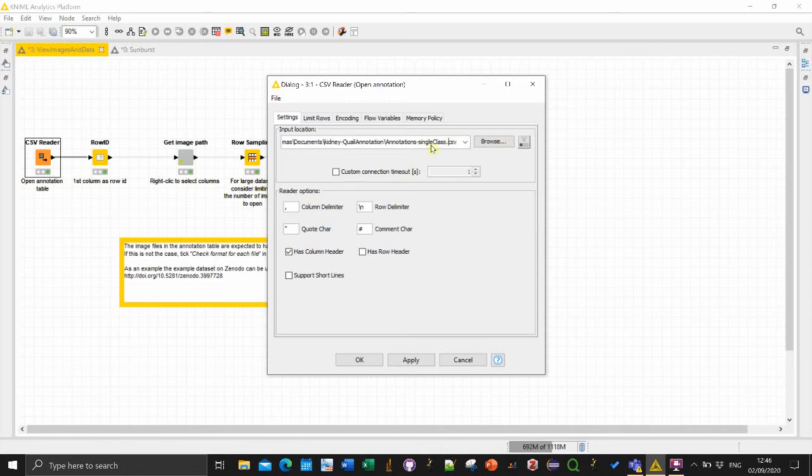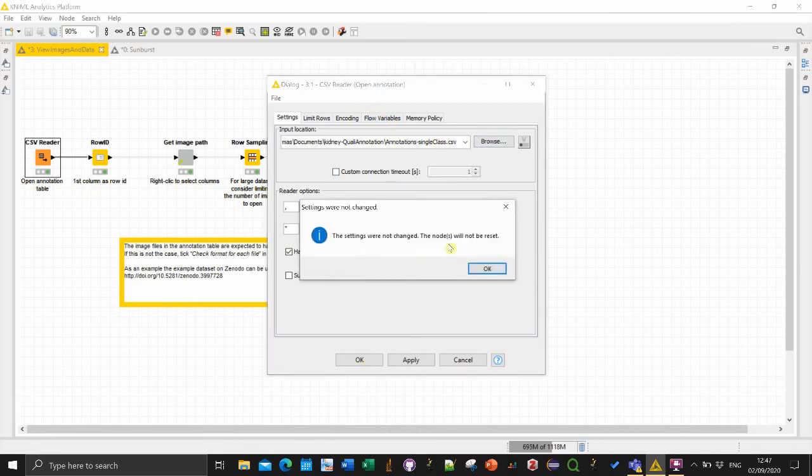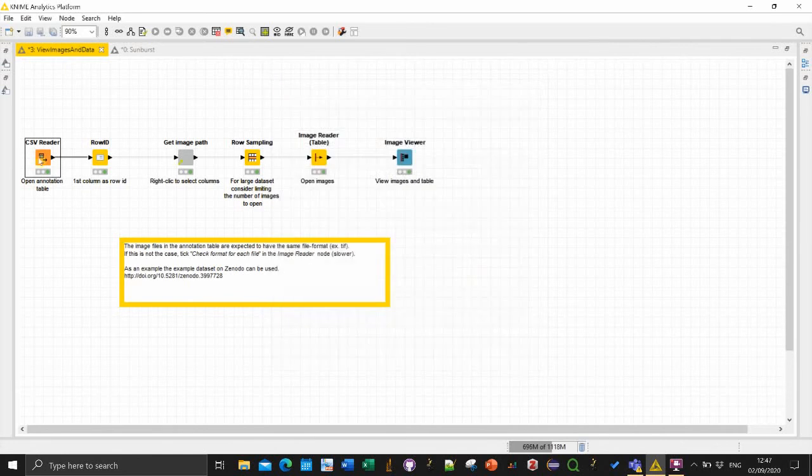So you can then browse to get your CSV file. Any CSV file that was generated from the annotation plugin will work for this particular workflow. So in this case, yeah it's already loaded in my case.